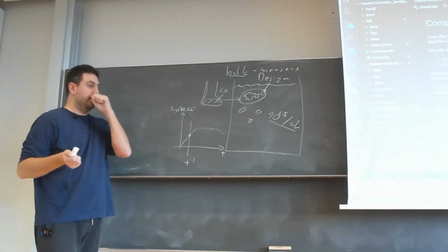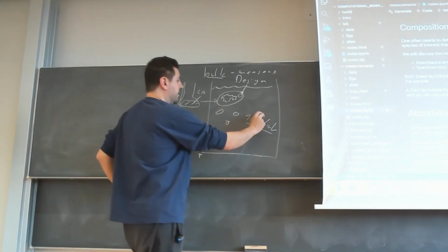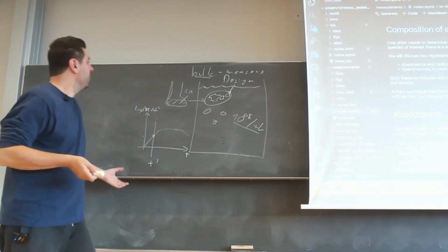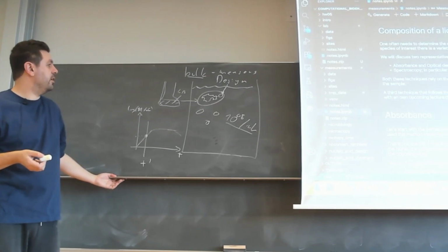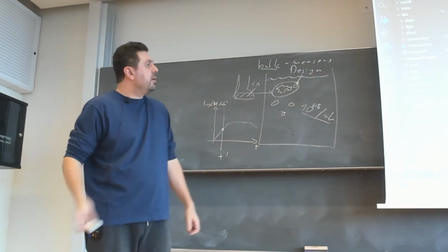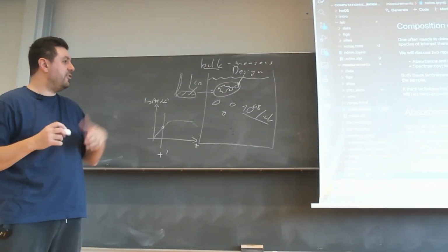So you see this by the eye. The thing is, of course, this is not a very precise measurement, but it gives you a kind of set point whether you are reaching something in the order of 10 to the 7, 8. So you can detect this quite late with the eye, but it's a rough measurement. And the question is, can we do this more systematically, with equipment, but relying on the same principle of absorbance? And the answer is, of course, yes, we can. This is not something very new. This has been done since ages.